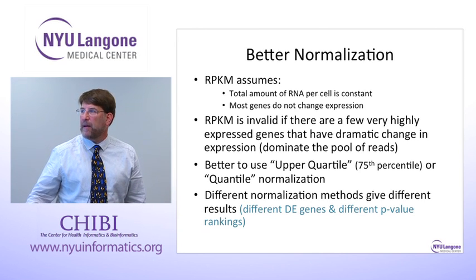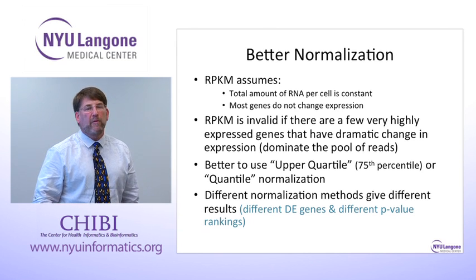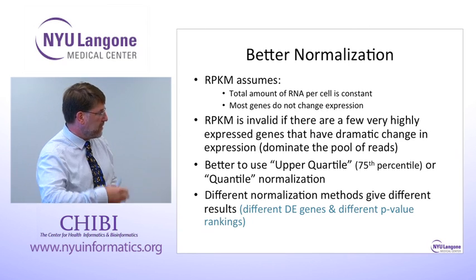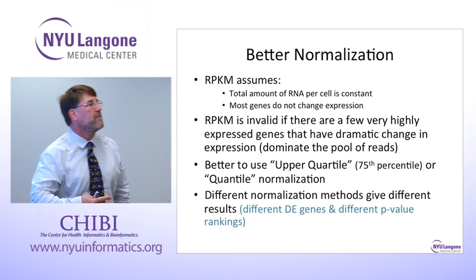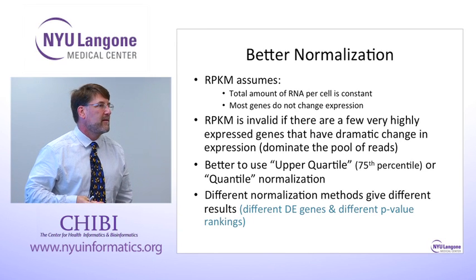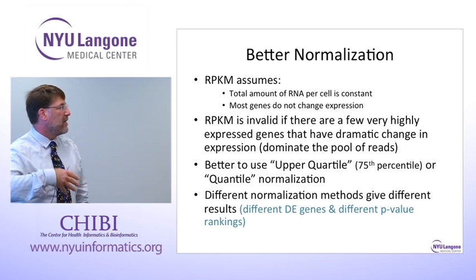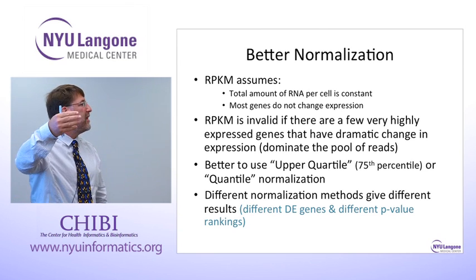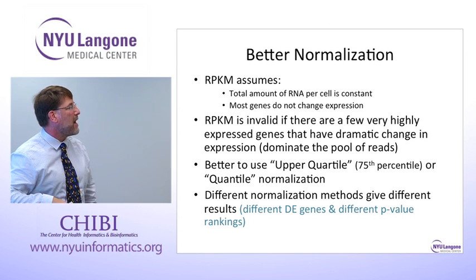The methods that are popular right now are using quantile normalization. And we've definitely tested this fact. Different published normalization and differential expression methods give different results from the same data. And people aren't thrilled about that. The best we can do right now is use several different methods and give you the intersection and say, OK, this gene is showing as highly differentially expressed by several different methods. It's at the top of the heap.